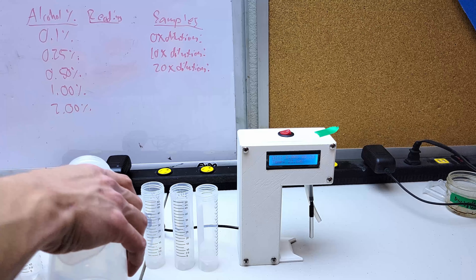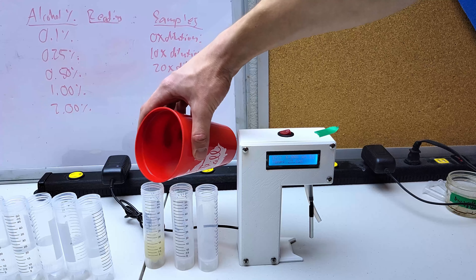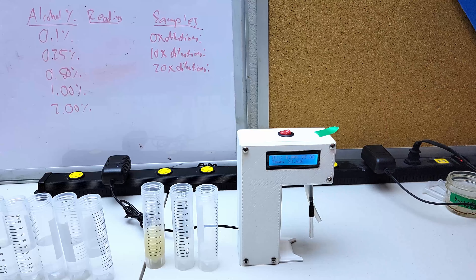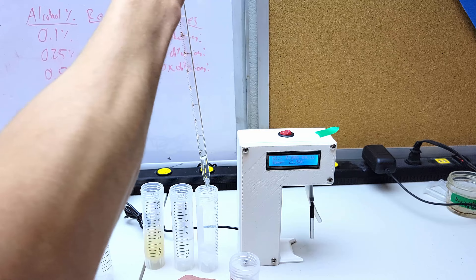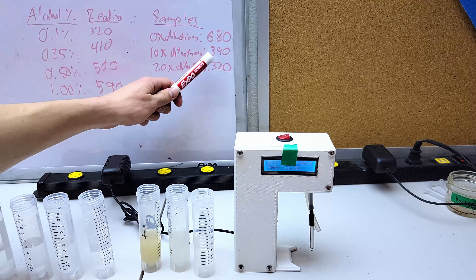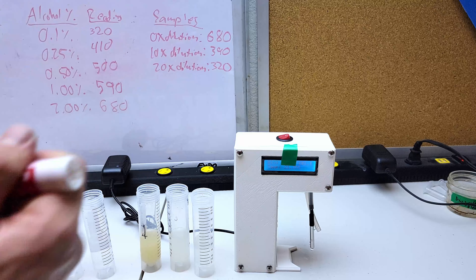The first thing I did was measure the alcohol content, and I found it to be about two percent. I used my alcohol content detector that I built for kombucha brewers — I've been selling these for about two years now. I ran a calibration curve with known concentrations of alcohol, did several dilutions to the fermented yeast media, and measured them all in the detector. They came out with the same approximate alcohol content of two percent. This was a rough test, so I don't know if it was actually 1.9 or 2.1 percent, but two percent was a pretty close approximation.